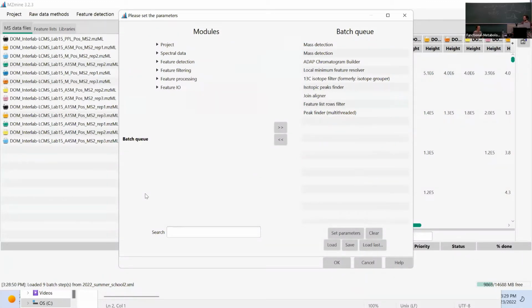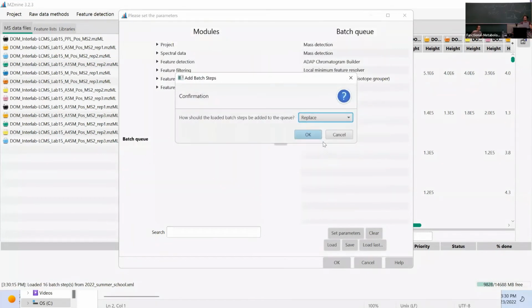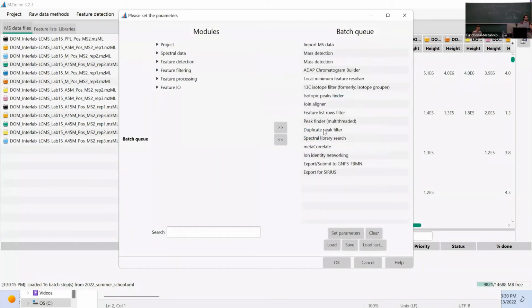But for the sake of proceeding now, I would go back to the batch Robin just highlighted, and then load this. The only thing you need to do is change the file path to actually take the files, because with the different labs, they have different file names on your computer. And also specify the file path for the output files. All the rest of the settings are preset.